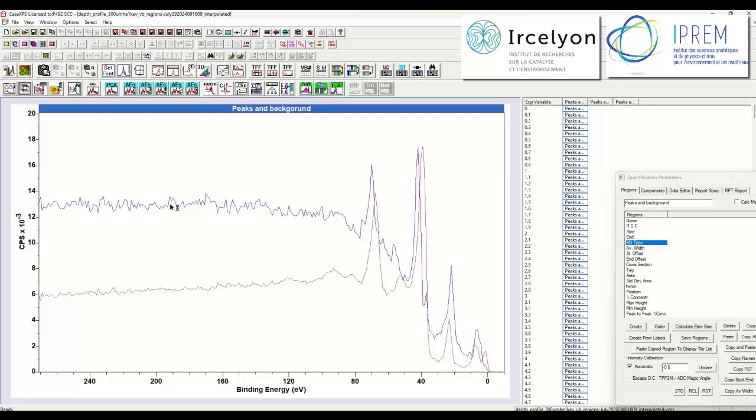My assumption is that the removal of the carbon, which can be seen from the carbon 1s spectra in this data set, has the influence on the spectra at the upper end of the kinetic energy range, lower binding energy range, that the background lifts considerably when we have carbon, and when we remove the carbon and whatever influences are taking place on the oxide and the metal below, then that manifests as this second shape.